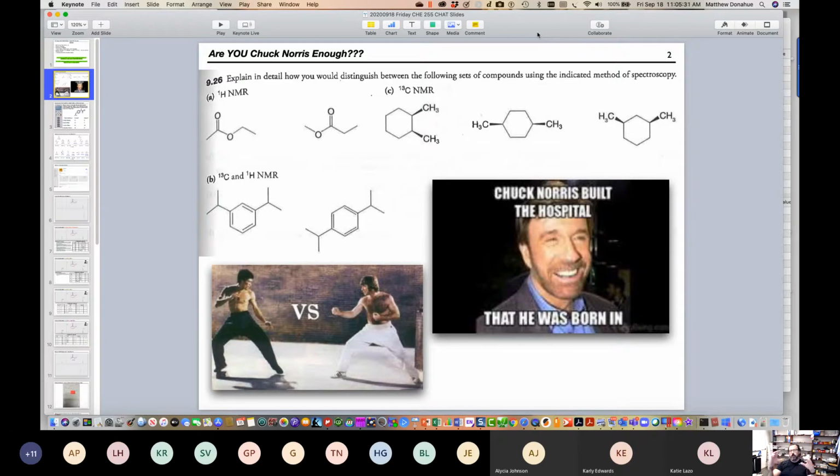If you are given two spectra, how would you assign the structure to the spectra? What's your thought process? So Tenley says the ester is bonded at a different place. Yeah, that's definitely a solid observation that we can use to our advantage.